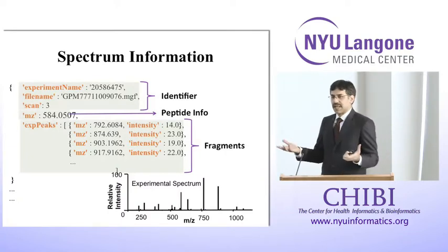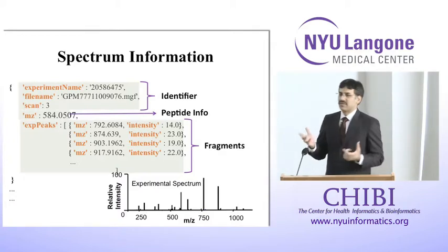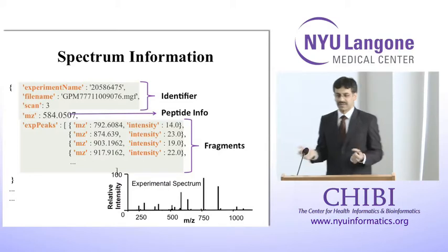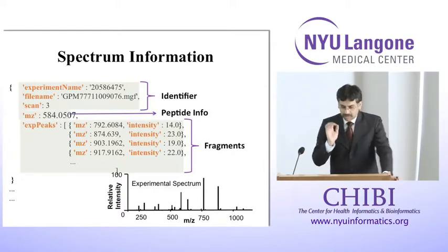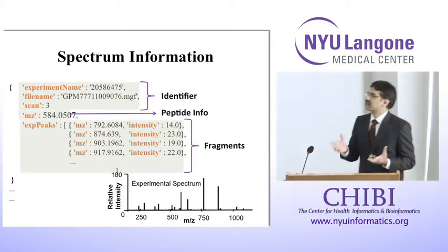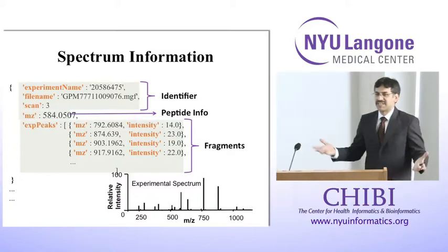So there are several algorithms, again, which do this kind of work. And the basic idea is that you evaluate each spectrum against several candidate peptide sequences. Okay, so let's assume that this is one candidate peptide that we want to evaluate. So we have some general idea about how these peptides fragment. Okay, so we create a theoretical spectrum for these peptides, and we can compute the mass to charge ratios of various fragments that these peptides can generate.